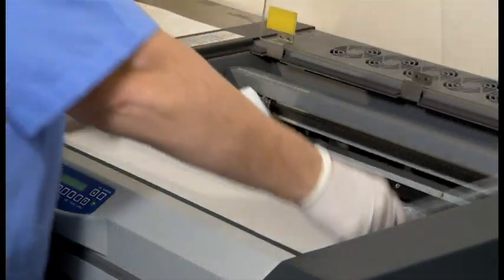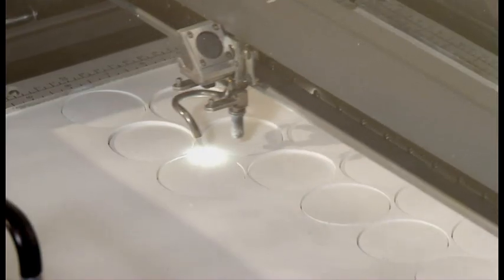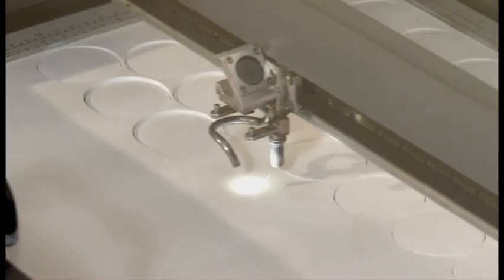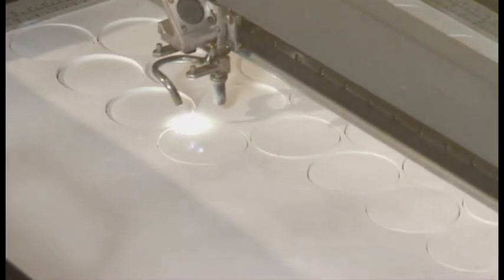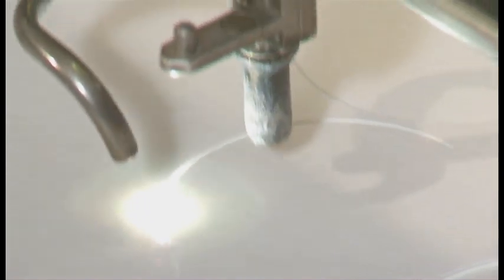Each individual filter is laser cut for exacting size. Laser cutting seals the edges of the filter better than die cutting, thereby reducing debris that can affect weight.